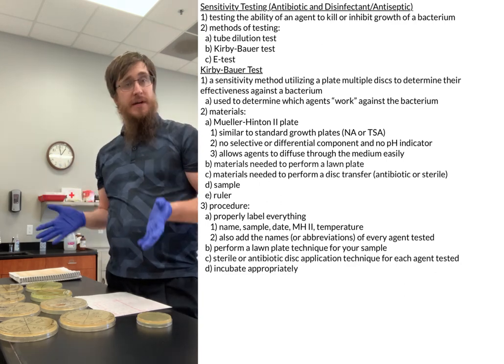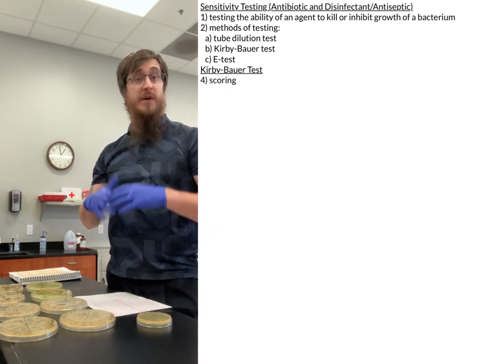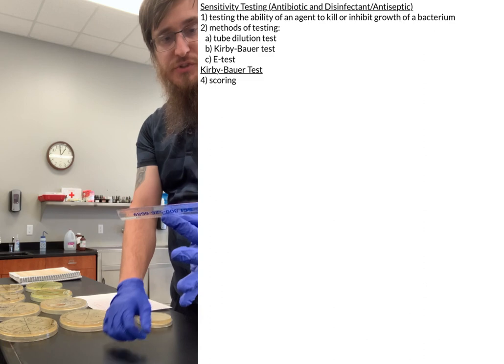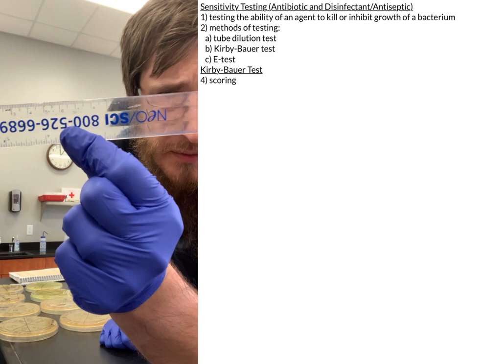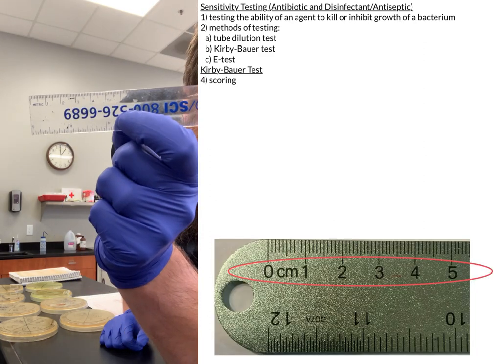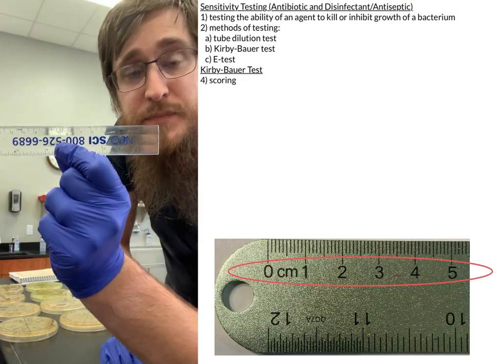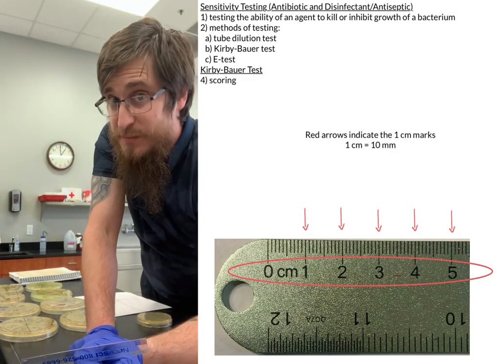All right, with that out of the way, let's move to the scoring part of this lab and the way that we actually score our plates. This is where our ruler is going to come into play. On the rulers, we want to measure in millimeters. On the metric side, the one at the top, you can see all the little numbers. It goes from 0 all the way to 15, and each of those numbers represents a centimeter. Each centimeter has 10 millimeters in it.